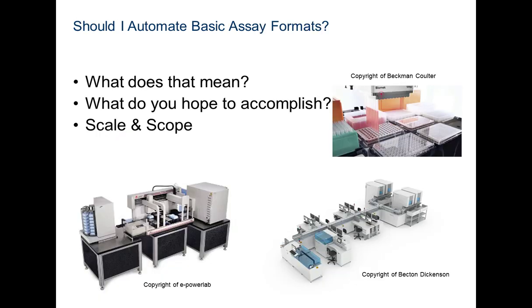fluorescent. So now that we've gone over a few of the assay formats of ELISA and those derived from those basic principles, we'll touch on automation. And first of all, what does that mean?